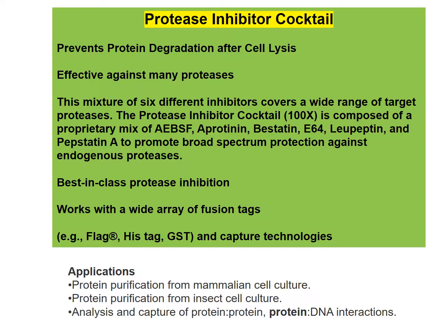The proteases inside, say, a liver will already be chewing nanoseconds after the liver cell is broken up. So I understand it may be a few seconds after we pop the cells open and we add the cocktail, but that can be a lifetime for the proteases. So in the lysis buffer, we will actually go ahead and spike it with a protease cocktail, and it's effective against many proteases. Notice not all, just many.